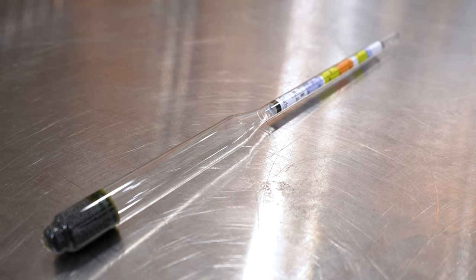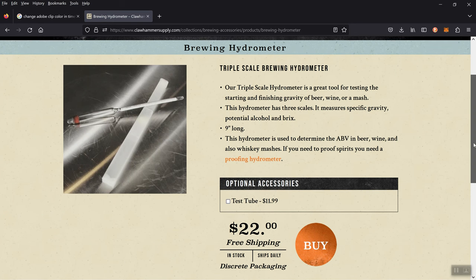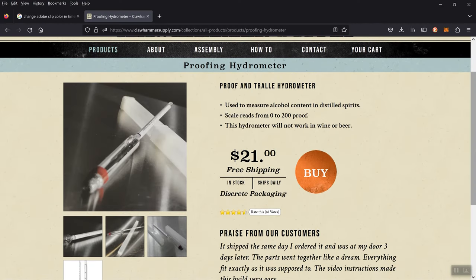There are several tools that allow you to take these measurements, and the first one I'll show you how to use is a hydrometer. The most important thing you need to know about hydrometers is that there are actually two types: brewing hydrometers and proofing hydrometers. Brewing hydrometers are used to measure the density of whiskey mash, beer wort, finished beer, and wine. Proofing hydrometers are used to measure the density of distilled spirits. You can't use a proofing hydrometer for beer and you can't use a brewing hydrometer for spirits, so make sure you get the right one.